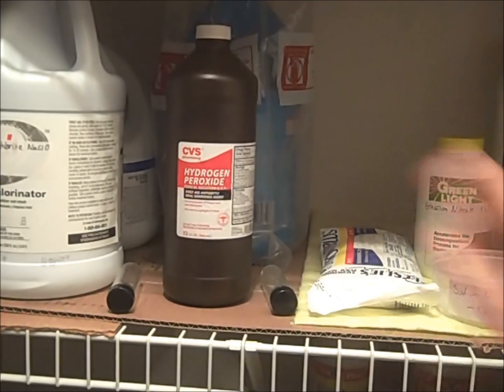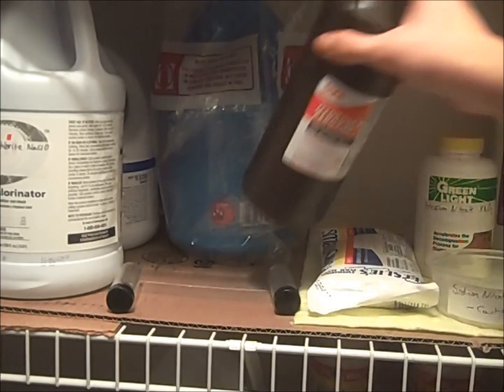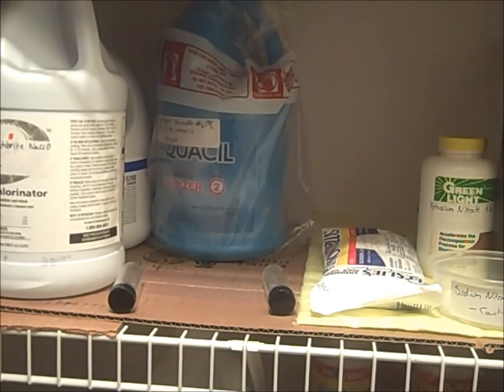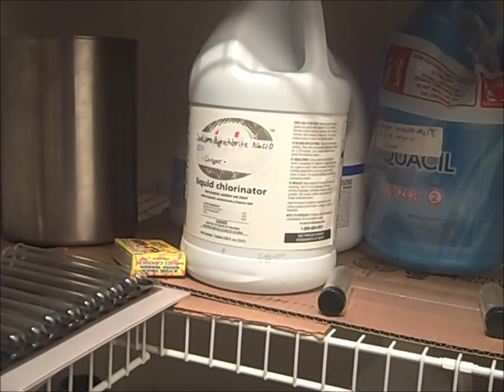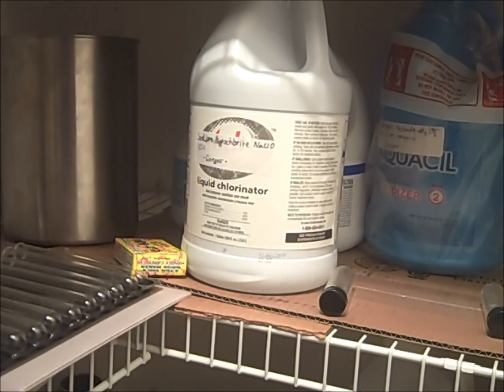This is drugstore hydrogen peroxide of 3% concentration. It is generally pure enough for use, although it is not a very high concentration. It can decompose when exposed to manganese dioxide, although it does not have as many applications as 27% hydrogen peroxide, which is here. This is sold at pool supply companies as a shock, which does not have chlorine in it. A shock that does have chlorine in it is sodium hypochlorite. This is typical laundry bleach, although that is only of 6% concentration, and this is of 10% concentration. Therefore, it is stronger and is recommended for use in swimming pools.